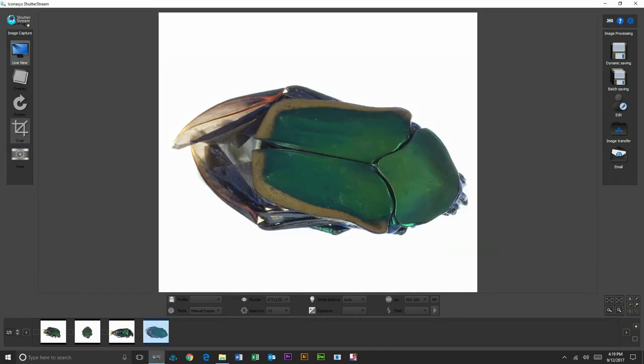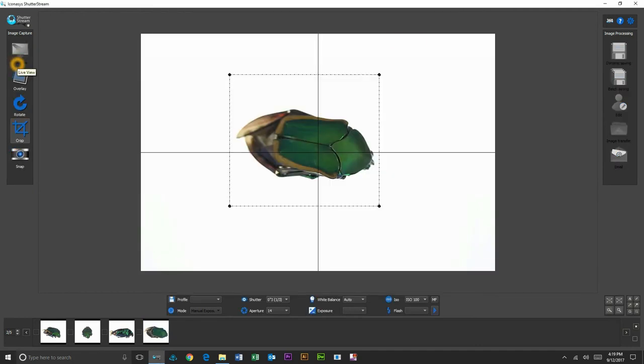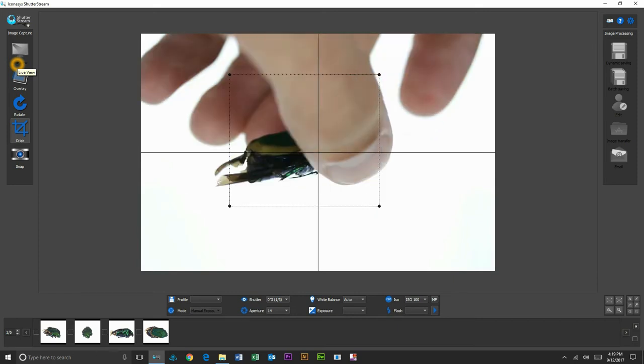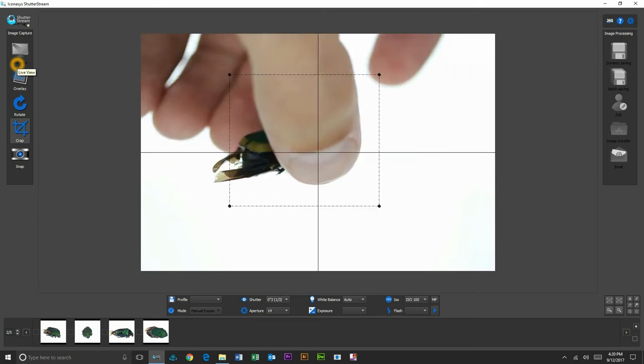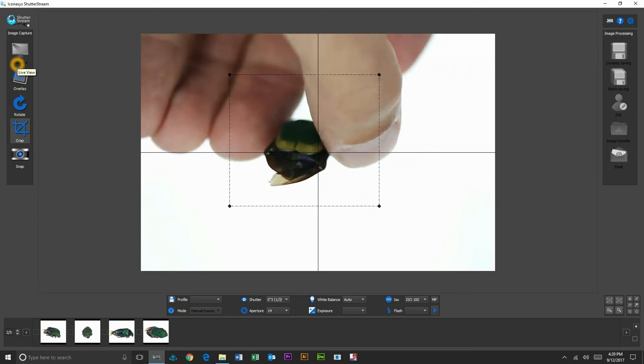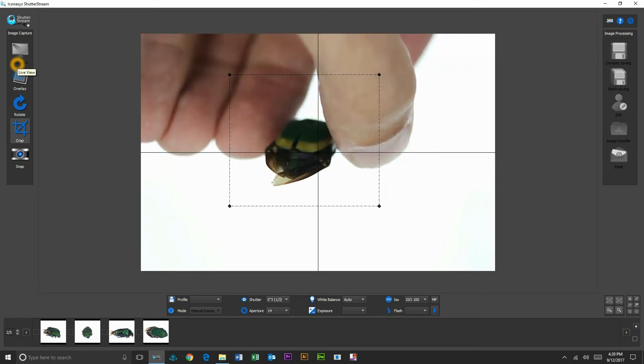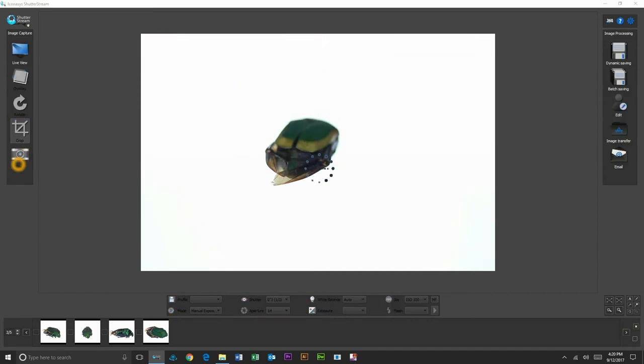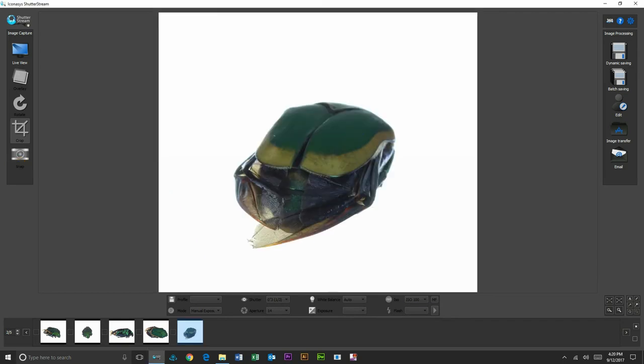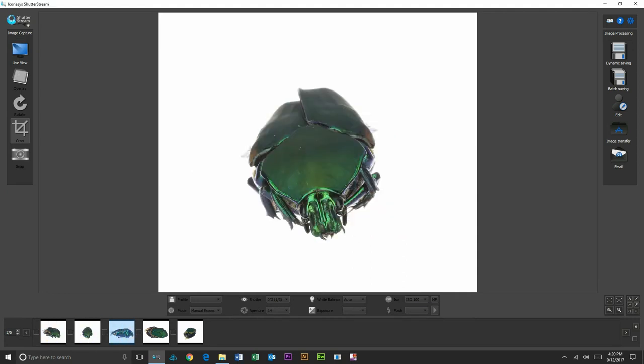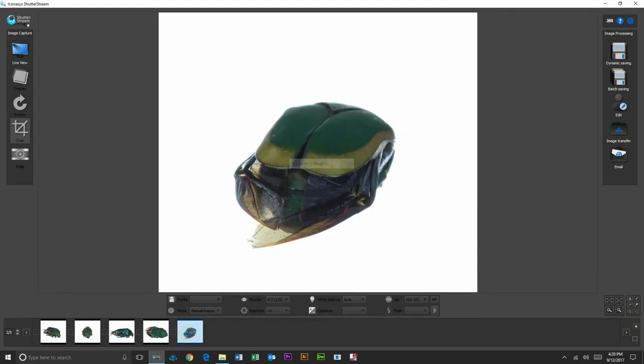And then we'll take just one more image, maybe just at the back of the subject. Okay, so these will be our standard five images. Probably one thing I should have done there is adjusted focal point, but you can see it turned out quite well. So we just shot our five images here. Now we can start to make some adjustments.